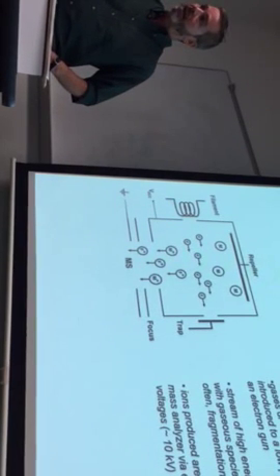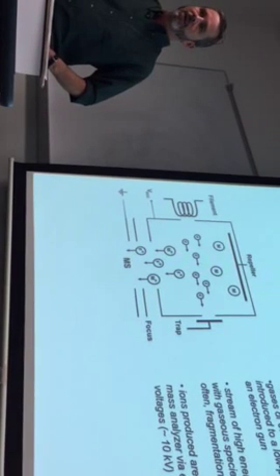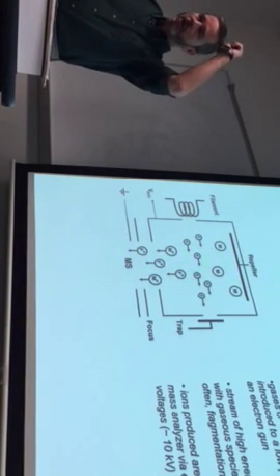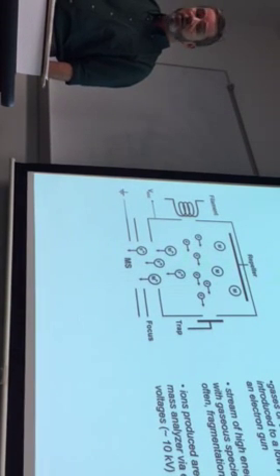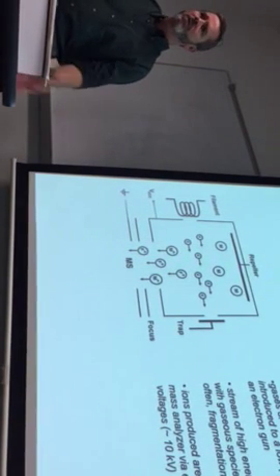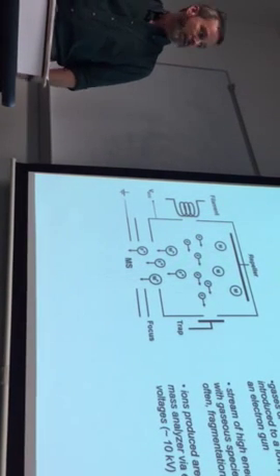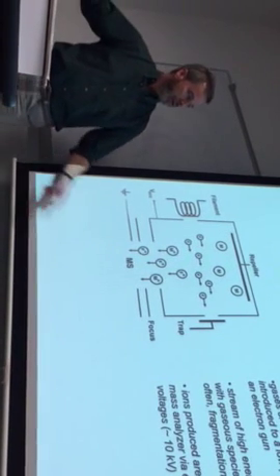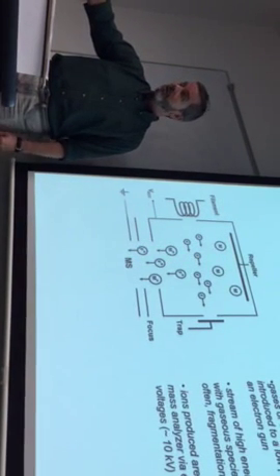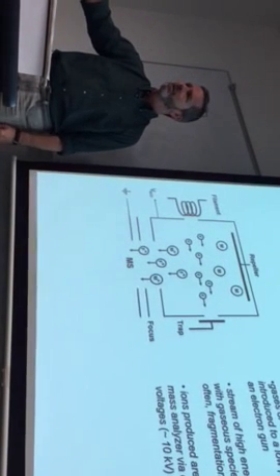Here's a physical analogy: people with hats. The people are the molecules, their hats are the valence shell electrons, and you're standing by a subway rail, or the side of the road, and these big semi-trucks come by, and the wind can blow your hat off. So those electrons streaming by can blow off an outer shell electron. And it could be that there's so much energy that it could blow off your arm, so you might fragment.